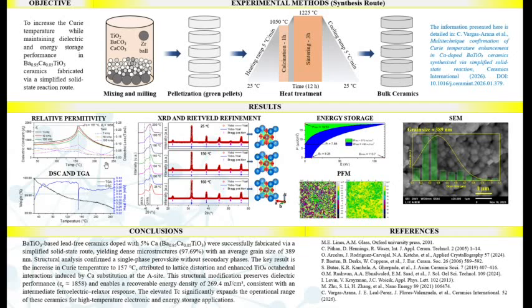Now, why does this matter so much? The permittivity versus temperature curve is the standard, most accepted way to determine the Curie temperature in bulk ferroelectric ceramics. And what we got, 157 degrees Celsius, is notably higher than what you'd expect for barium titanate doped with just 5% calcium, and well above the 130 degrees Celsius of the undoped material. That result was surprising enough that we didn't want to rely on a single technique to confirm it, so we brought in 2 independent methods to check it.